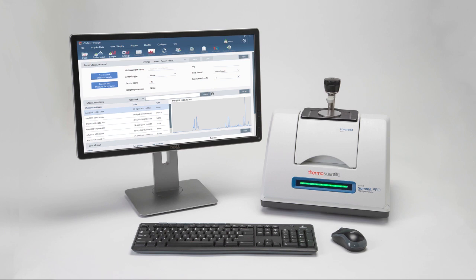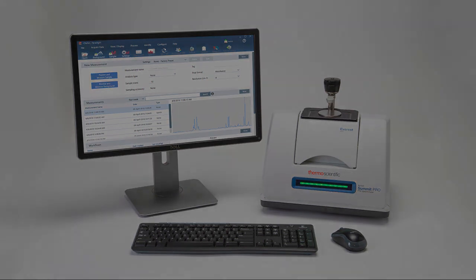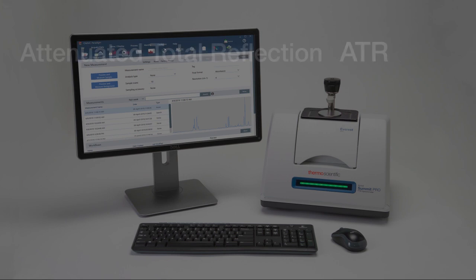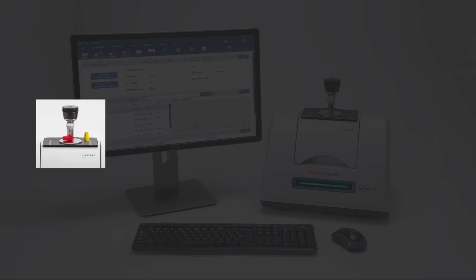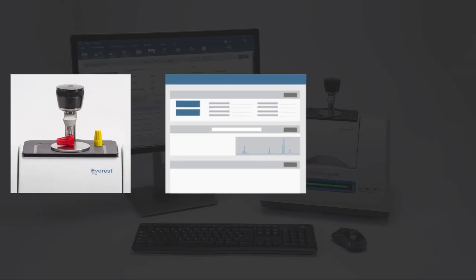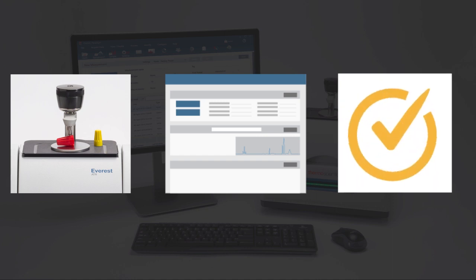Your FTIR spectrometer and Omnic Paradigm software can help you determine what's in an unknown sample. This video demonstrates how to measure and analyze a sample using the attenuated total reflection, or ATR, sampling technique. You will learn how to prepare the ATR accessory, set up and run the analysis, and evaluate and confirm the results.